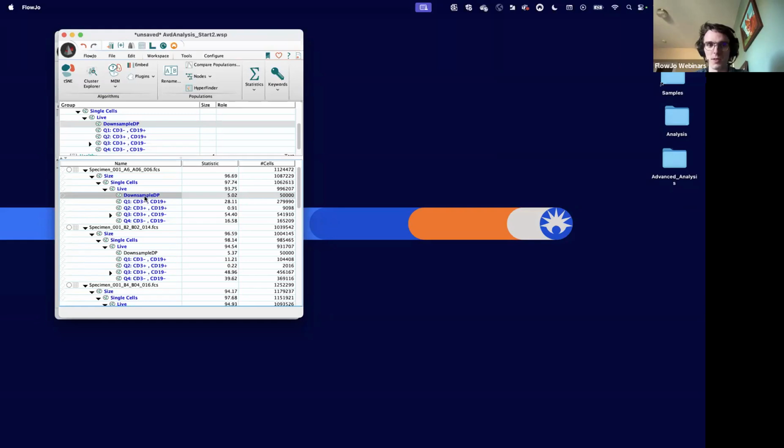We have an embed feature that can also be used to apply the results from one machine learning result onto another sample. But it's going to work better if I give it all the information initially and it can run its initial machine learning on a representative subset of all the samples. Because if it generates results and then I try to apply those results to another sample later, it won't make anything new occur. It's just going to fit the old results. Okay, so let's go ahead and combine this data together.